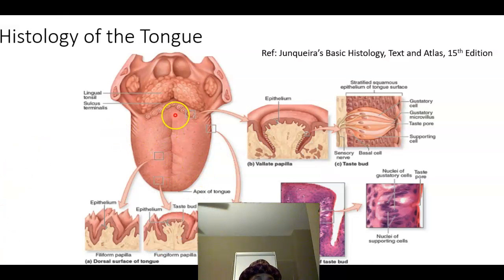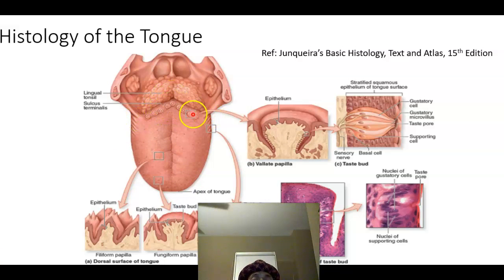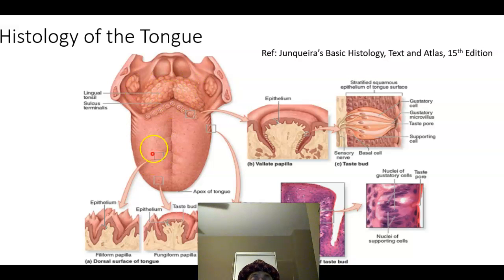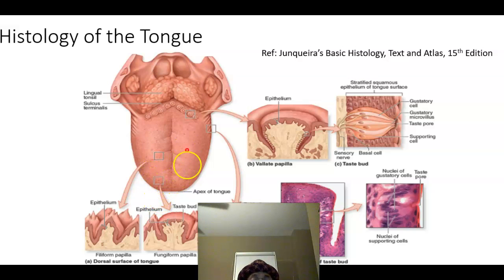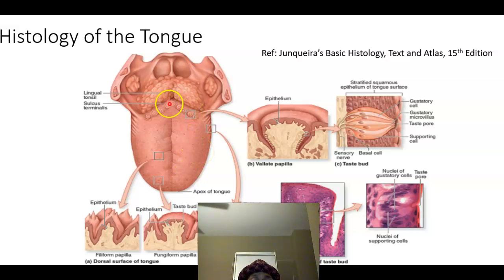This is the tongue — anterior two-thirds and posterior one-third. Here is the sulcus terminalis. These are the circumvallate papillae. The posterior one-third has the lingual tonsil. The anterior two-thirds has the filiform papillae, the most abundant, then the fungiform papillae, and the countable circumvallate papillae.